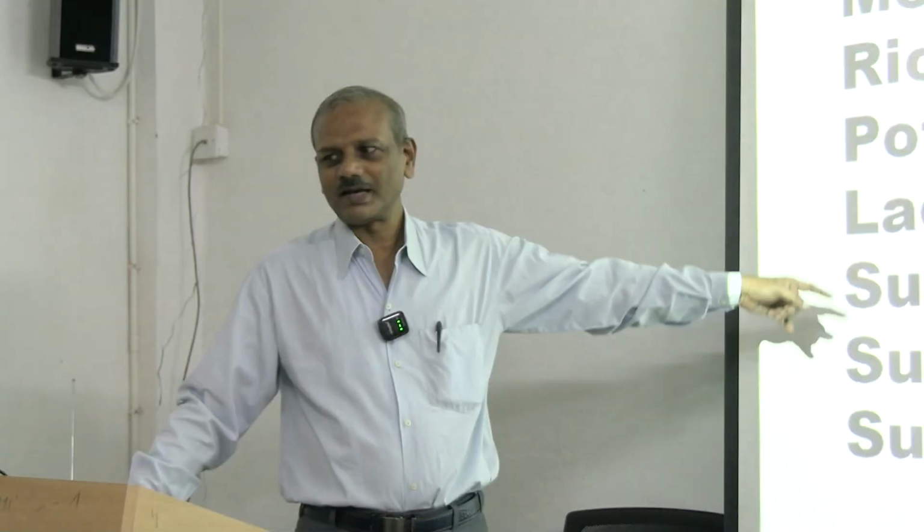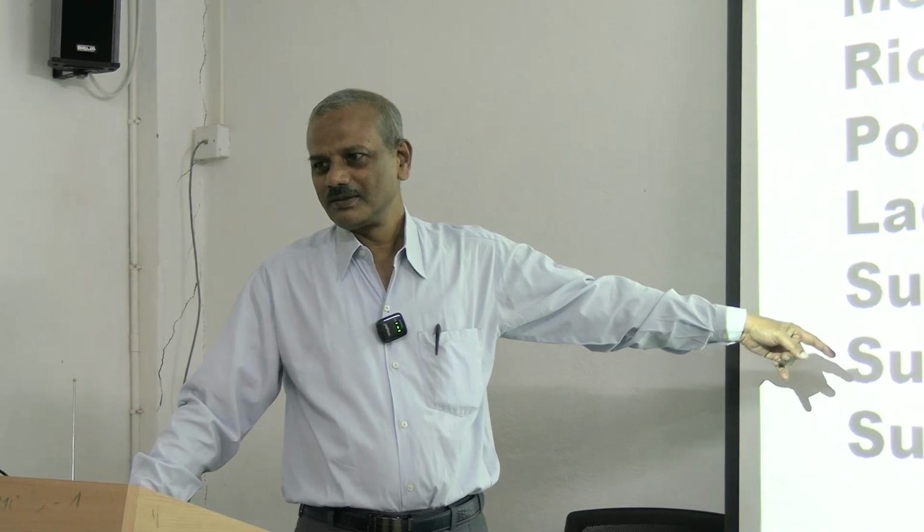Because see, life is an experiment. You have to do experiments continuously. Nobody has tested at least 20 times, which I have done. So whenever I used to go to the market, I would bring something and take it to the laboratory and they would test it. Is it giving a positive result? Because I had an idea that there might be some amount of impurity. But this is costing somewhere around 20 times higher than this one. So that was proved, and you can see also today a slight change is there. That means it happened during processing.